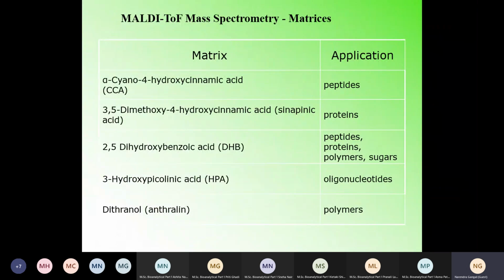Even after your MSc and PhD are over, if you start using bioanalytical research, you can have a variety. You can also invent some matrix which you may use for your molecules. So it is always an experimental aspect. More and more matrices can be added to the list. It is not fixed that only these matrices have to be used. These have already been used by scientists and they are very successful. But one can always try other things also.